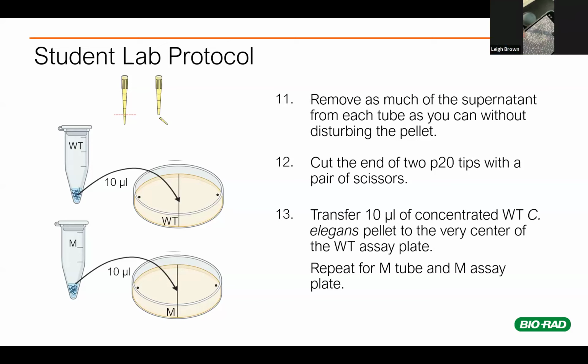And that will basically buy you back usually about 4 to 5 minutes on this lab. So know that that is a trick to be aware of. And of course, after it's touched, that also goes into the waste container that you would bleach or autoclave.